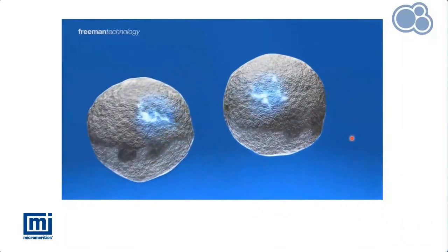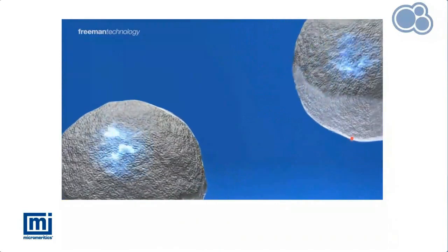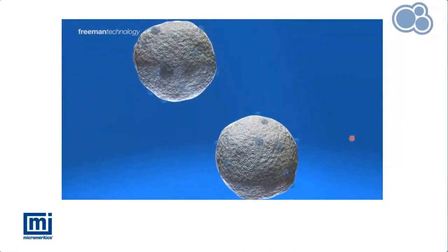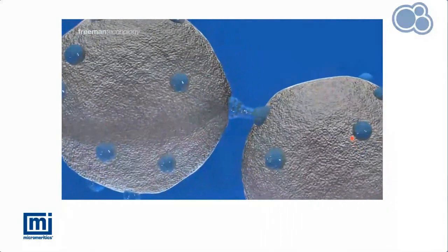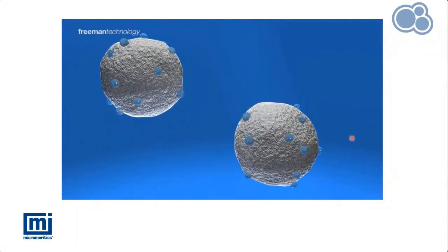Those electrostatic forces can also play a role in the particles binding together and the energy required for the particles to separate away from each other. And the topic of this presentation, moisture, so it's capillary bonds caused by the water being on the surface of the particles.